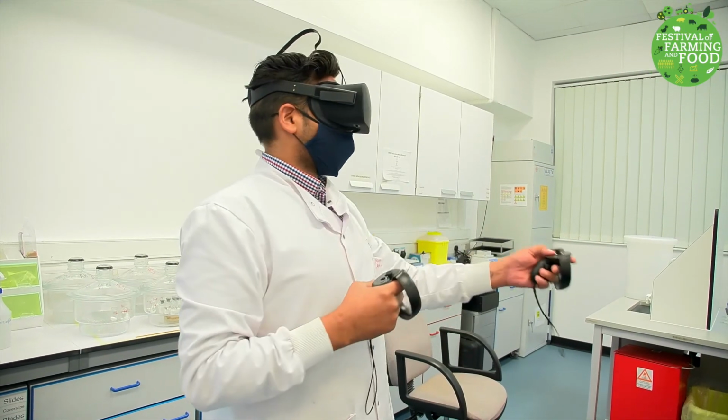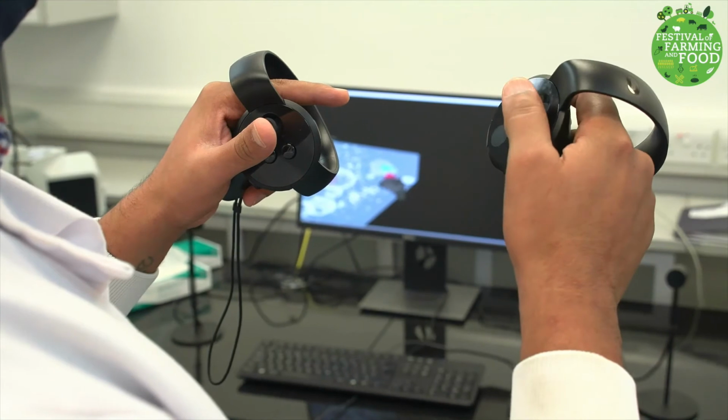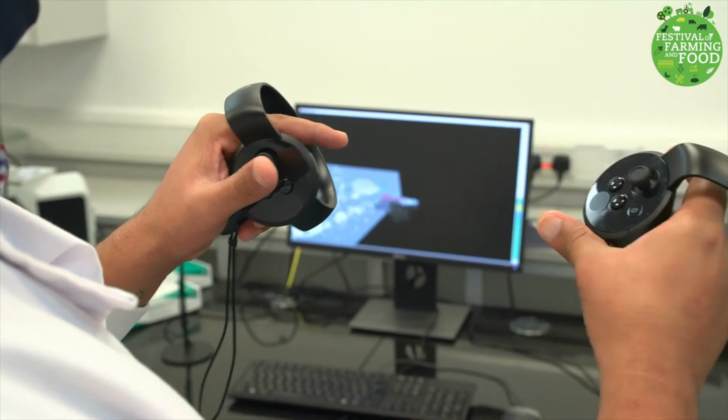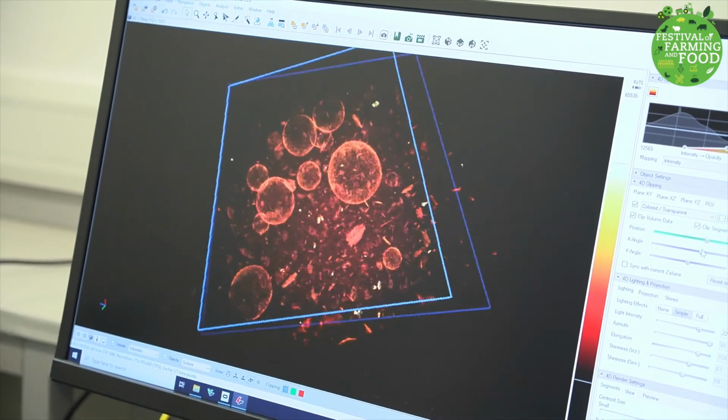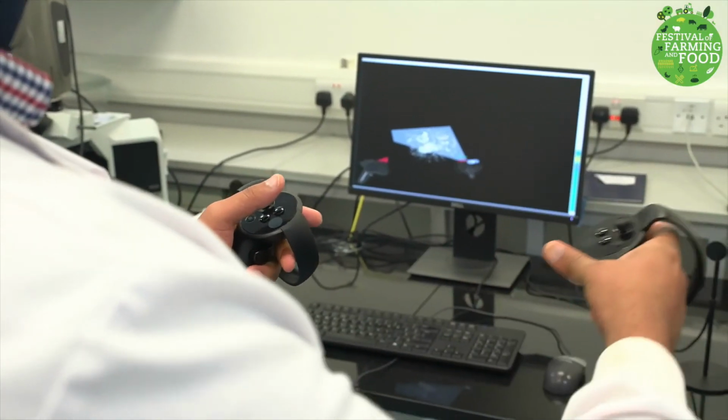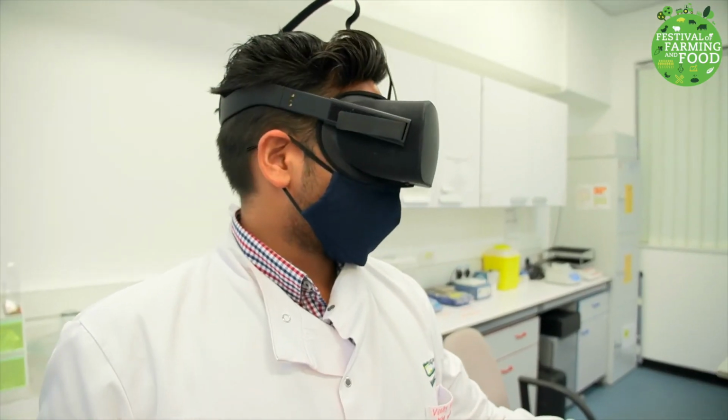We even use virtual reality to look inside our foods. Did you ever think you could put your head inside a loaf of bread and see its every detail? Did you think you could walk inside a meat carcass? With the virtual reality headset and controls, we can immerse ourselves in the food and do real-life four-dimensional analysis. Instead of seeing things in 2D and 3D on screens, we can, for example, measure the air spaces in this tiny powder particle using hand controllers with clever software and Oculus headsets. This gives a really good idea of how these structures are built and helps us understand how to create the perfect crunch, chew or slurp.